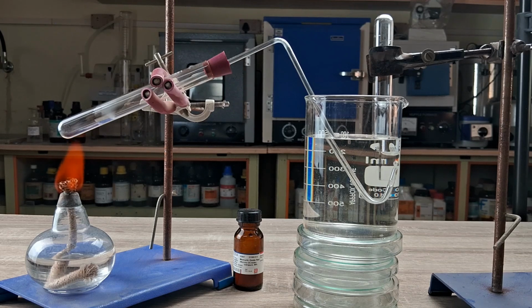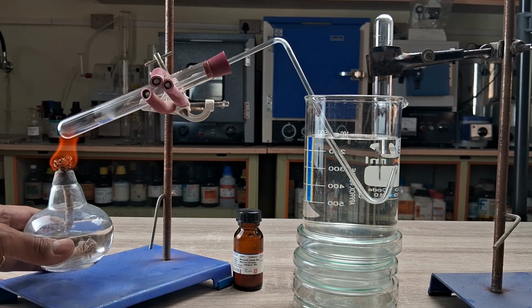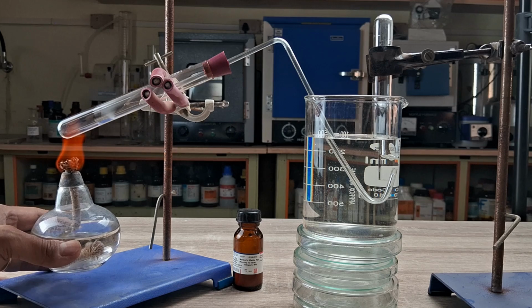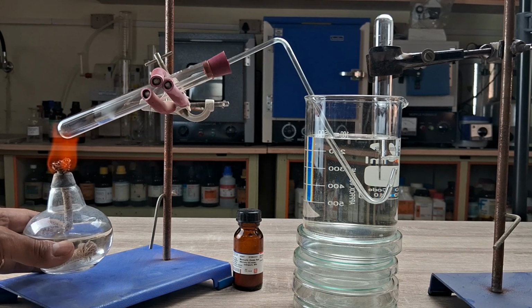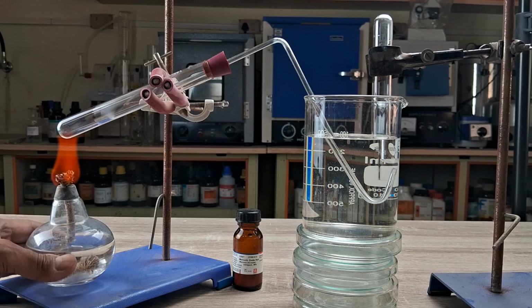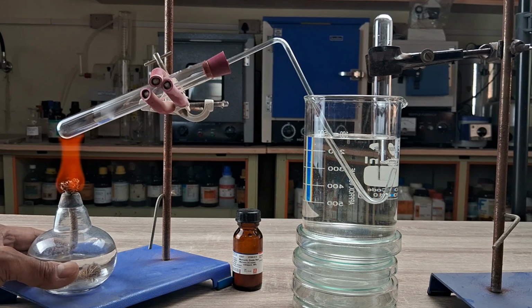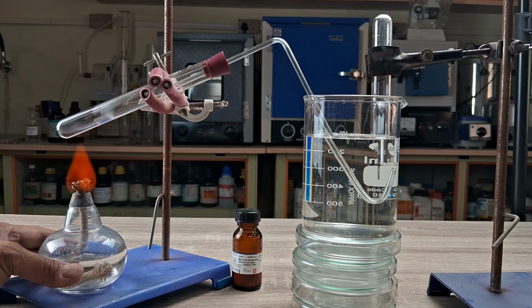In this video, we've discussed and demonstrated some common examples of decomposition reactions. You have probably noticed that all these chemical breakdown processes that we have demonstrated required an external source of energy, either in the form of heat, light, or even electricity. Such reactions in which energy is absorbed for the reaction to proceed are known as endothermic reactions.